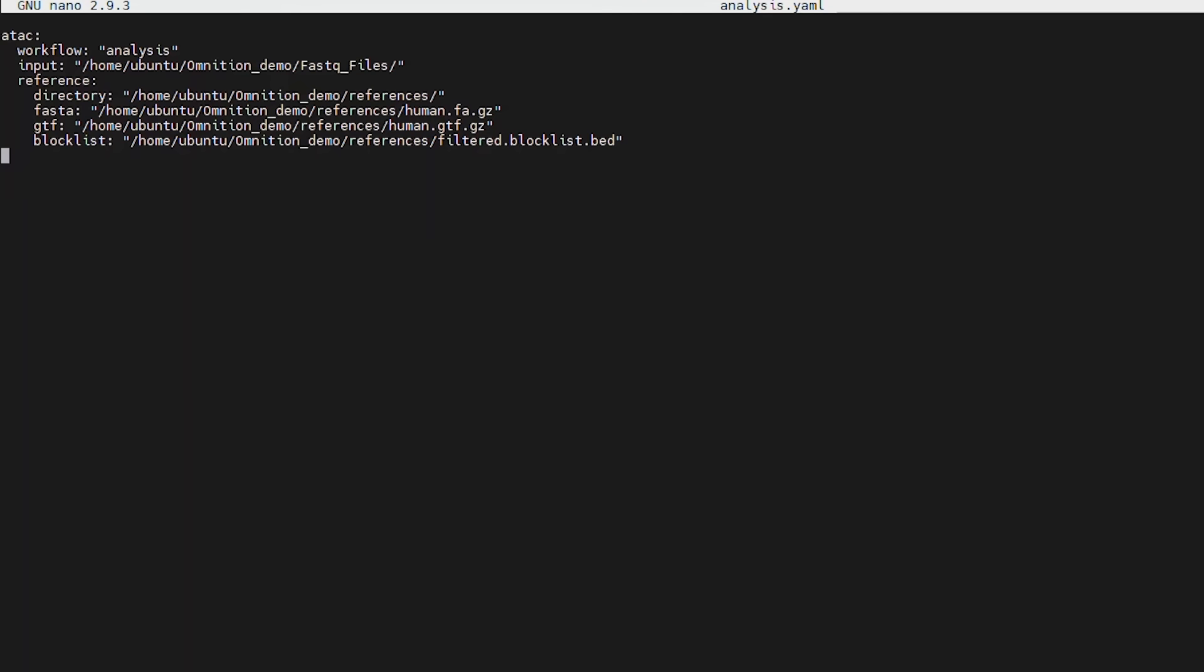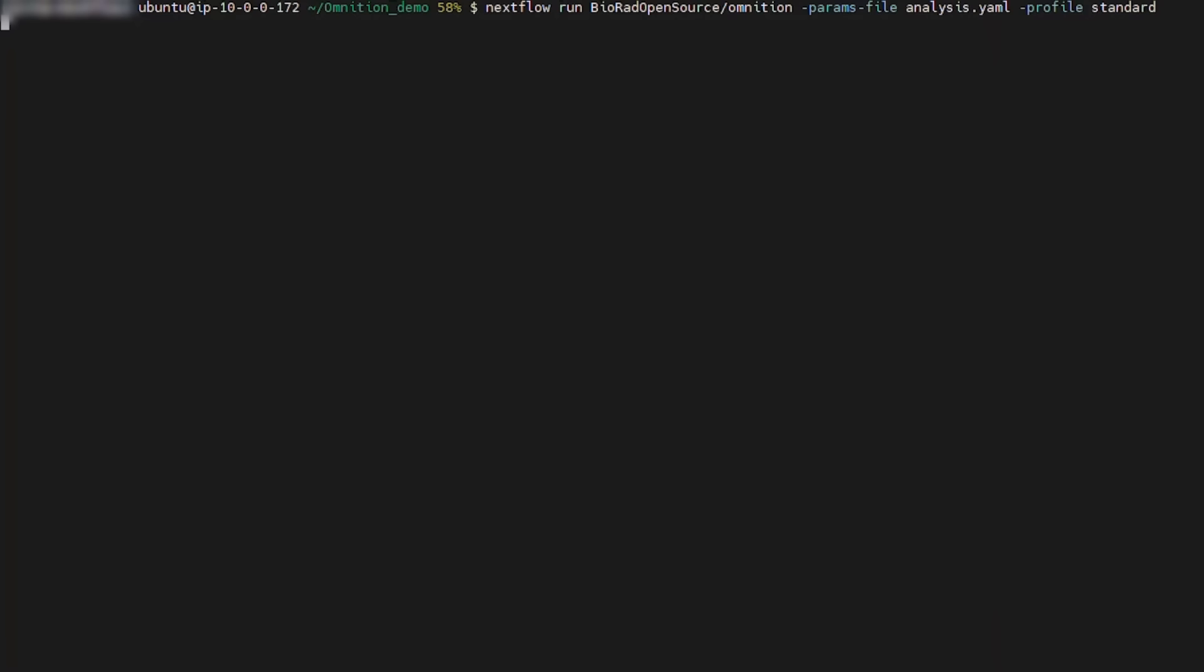The user will need to provide a new YAML file that is different from the one supplied for the reference workflow. This YAML file will contain additional parameters and specify the analysis workflow option. Additionally, a block list has been added to the YAML. Finally, this YAML file must include input parameter listing the directory path to FASTQ files for all the samples you wish to analyze. We will save this YAML file as analysis.yaml.